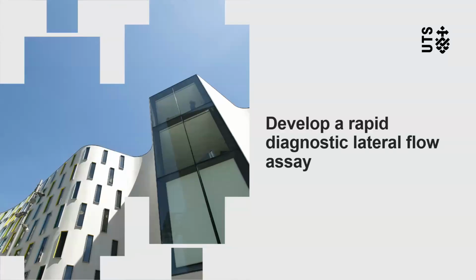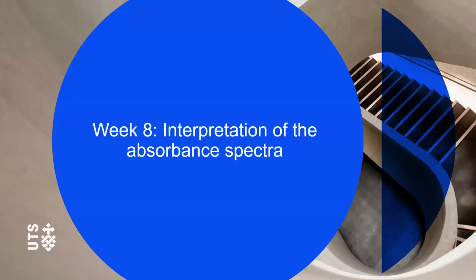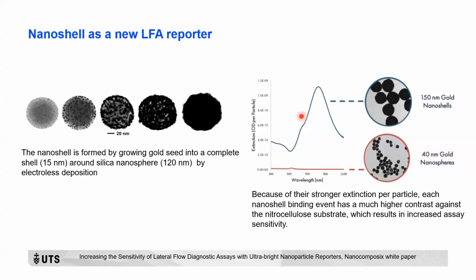Okay, so what I will discuss is how to interpret the absorbance spectra. I've already shared this with you during the Hive lab.